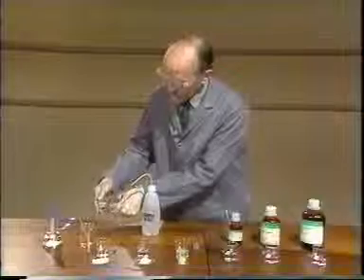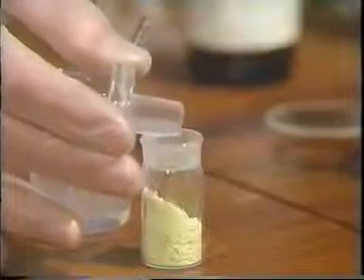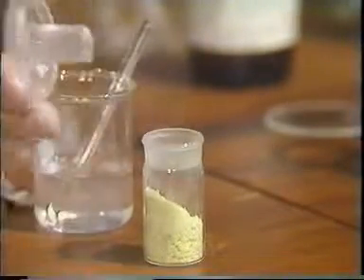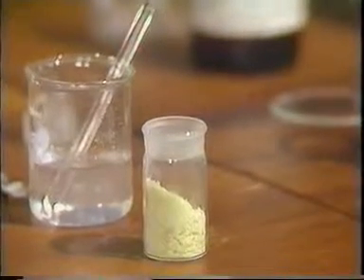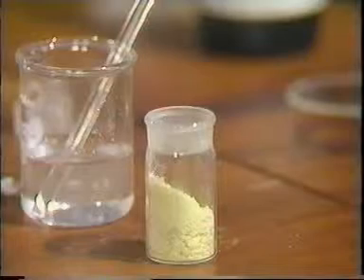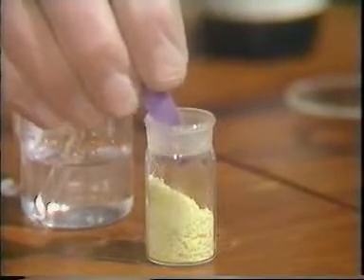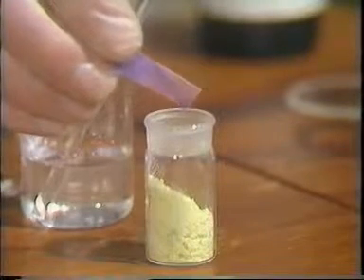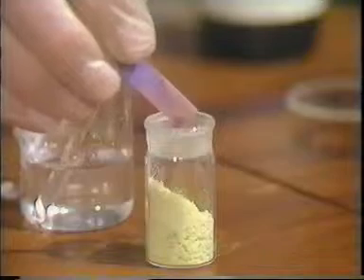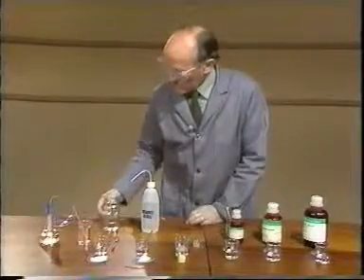Now I can test these fumes by using an ammonia stopper, and you can see there the white smoke being given off, which should tell you what the gas is. To confirm it, I'll put some blue litmus paper there, and you can see that is turning red, which confirms for us that the gas produced is hydrogen chloride.